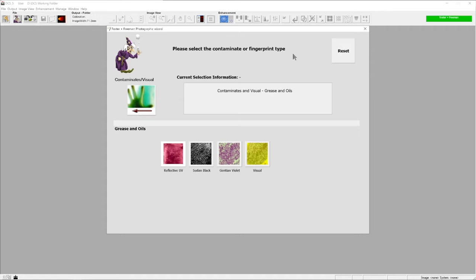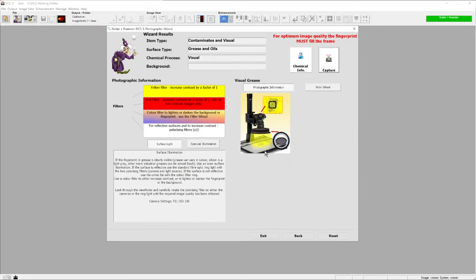This could be treated with something. We may use a treatment like either Sudan black or gentian violet. But if a treatment hasn't been used yet and the mark still needs to be visualized, it would be classed as a visual mark - a visible finger mark that needs to be photographed.